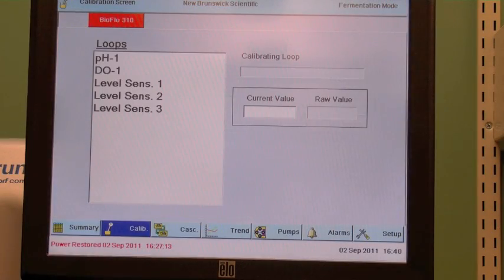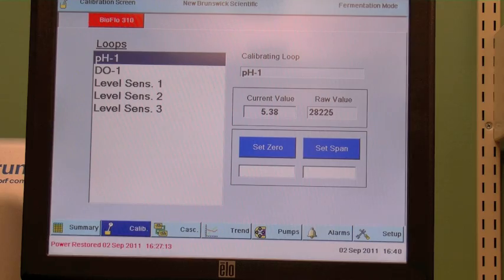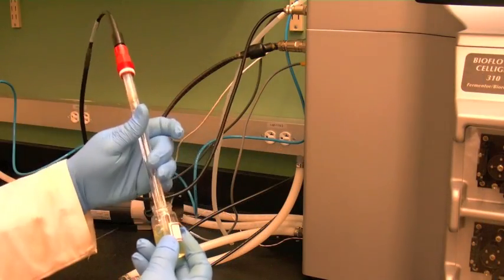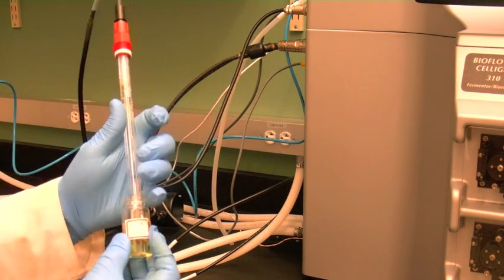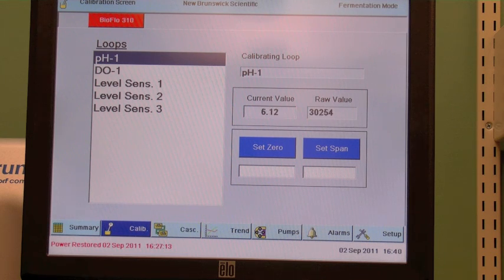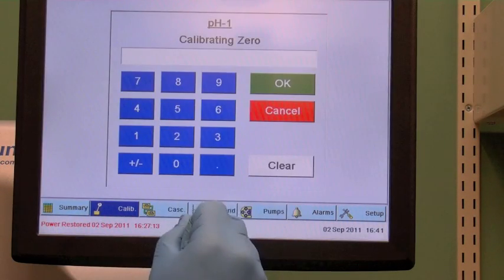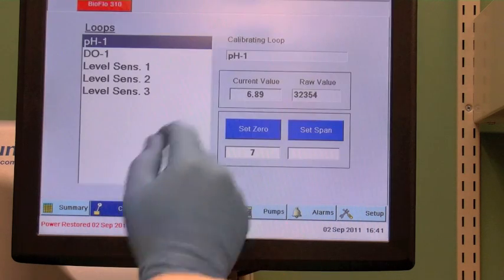On PCU, select calibrate button and then pH probe. Immerse the pH probe in 7 buffer and allow raw input signal to stabilize. Enter the value 7 in the box below set 0 button and press enter. Press set 0 button to accept value.